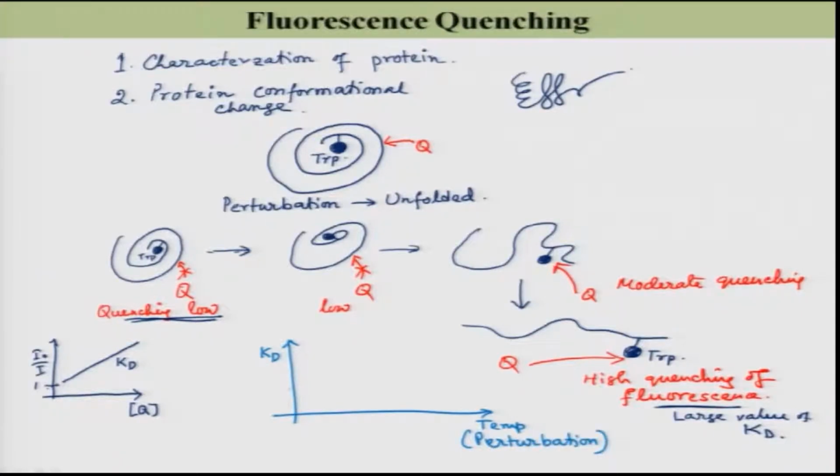Then what I am going to see is that the Kd value was really small over here, at the initial temperature or when the temperature is lower. So, let us say here is my room temperature, and as I increase the temperature, it may suddenly increase like this and then remain the same. The feature is almost flat here, then suddenly increases and then remains the same.